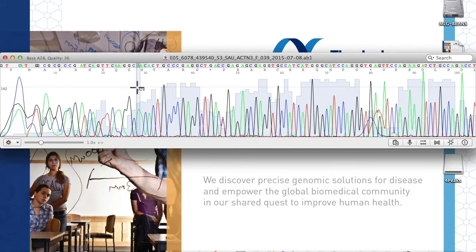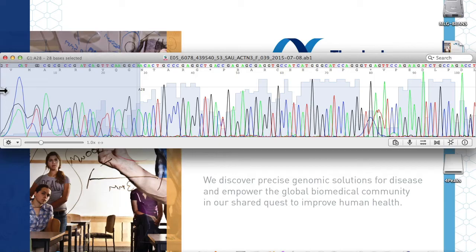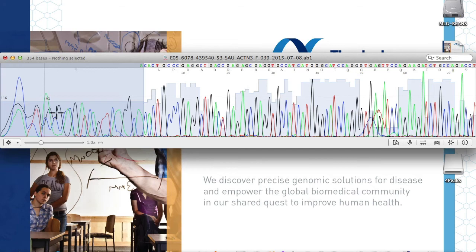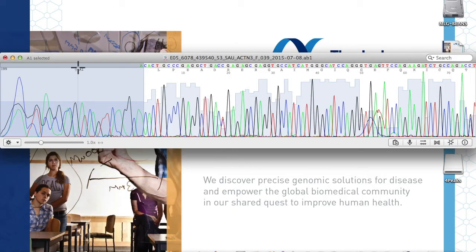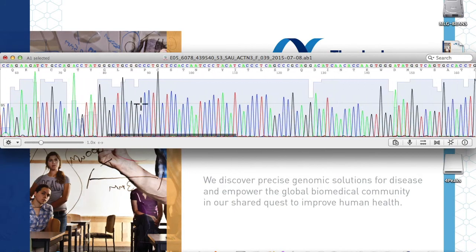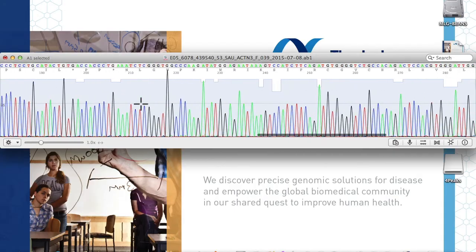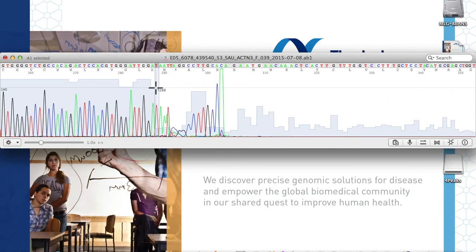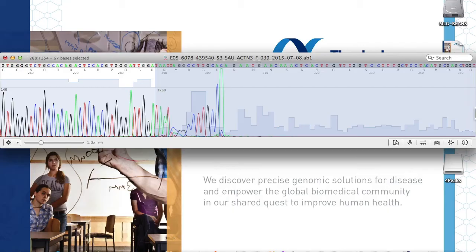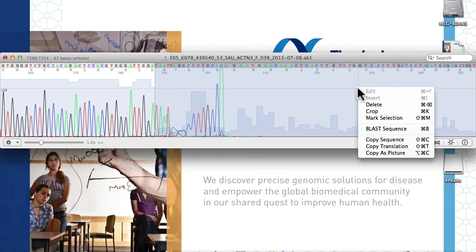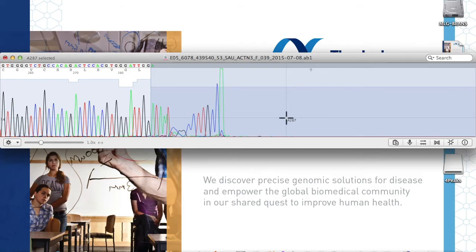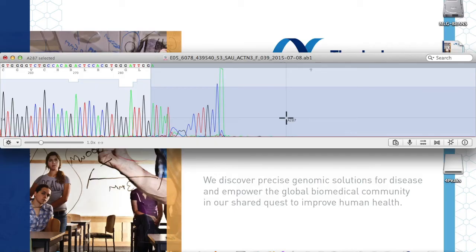Highlight and delete the area of low quality calls to be deleted. This does not eliminate the raw trace data, but simply removes the base calls by the software. Before moving on, scan the sequence by eye to ensure that the software is making appropriate calls.